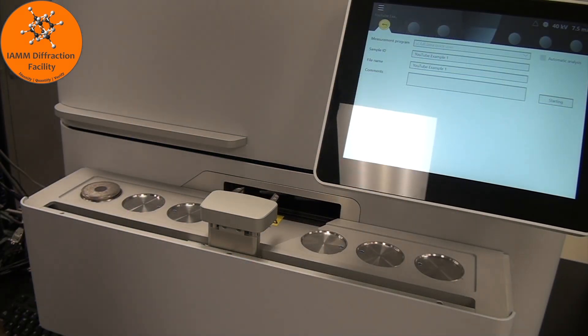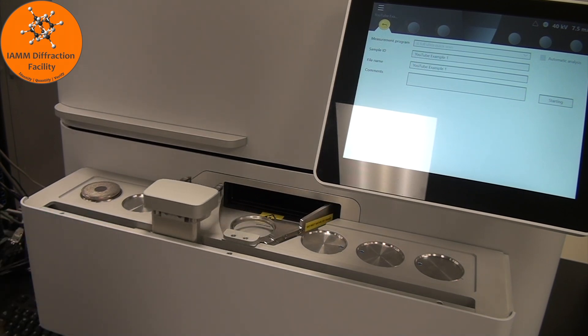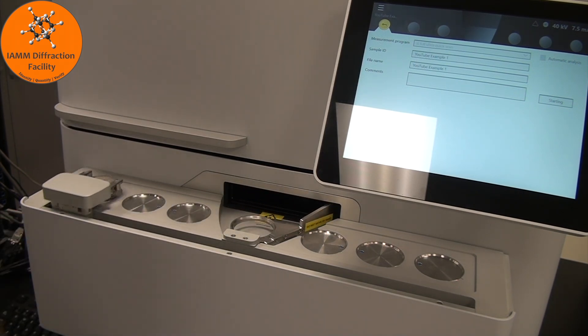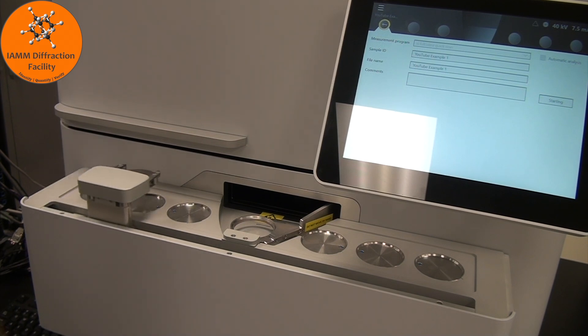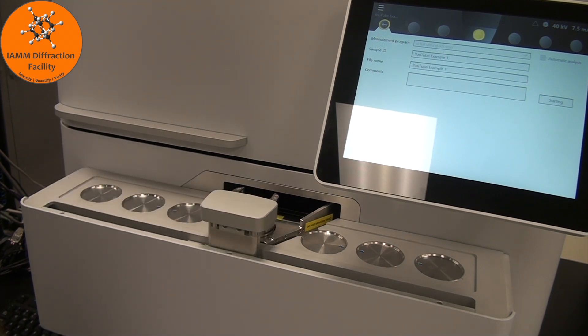We will see the little arm come over, grab the sample, load it into the next arm, which will then load it inside.